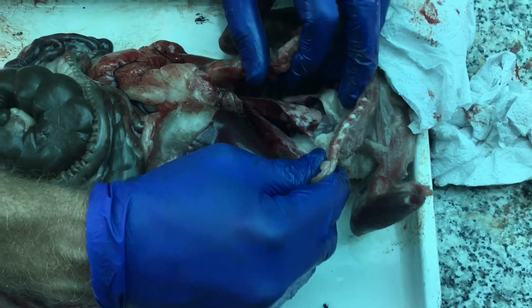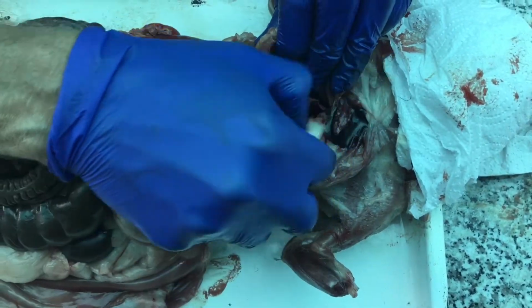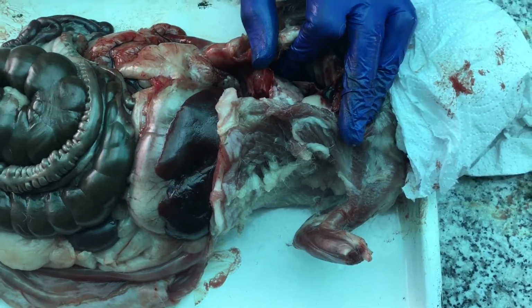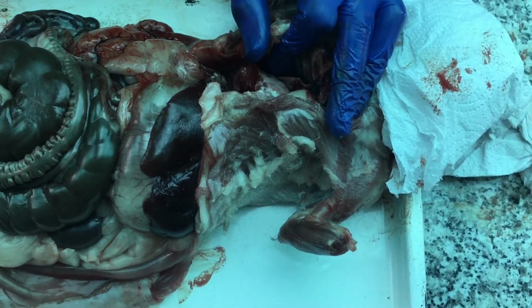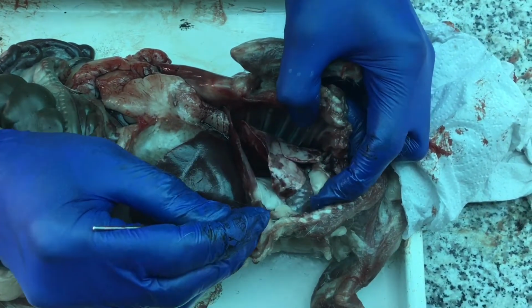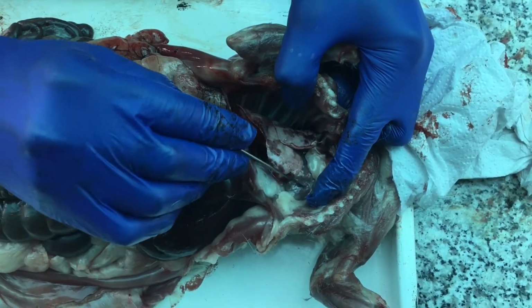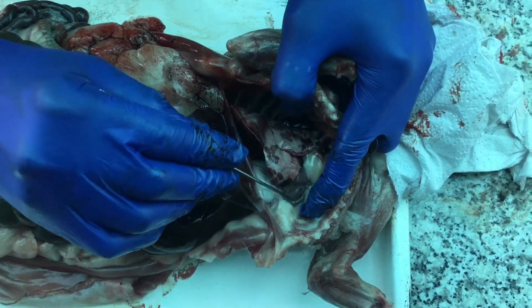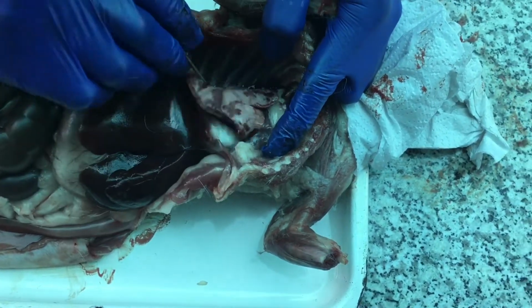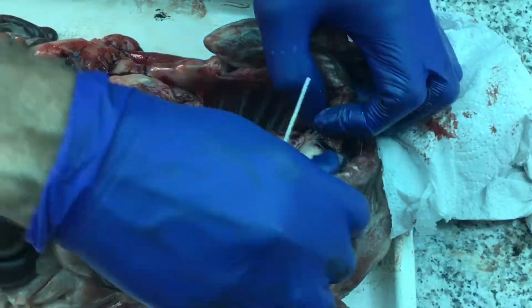Now, the thing in the chest, I'm looking in on what is the animal's right side. This is the lungs that we're looking at. This is the lungs here. And in the middle is the heart. This is some fat that's in the pericardial sac, or this piece of mesentery or serous lining that just surrounds the heart. And there's the lungs.